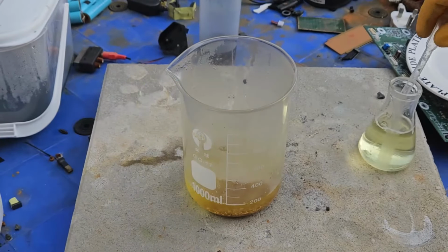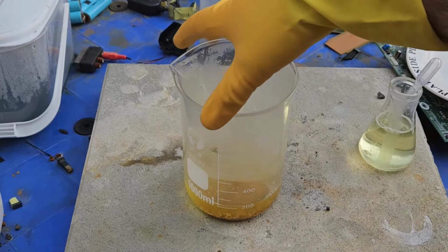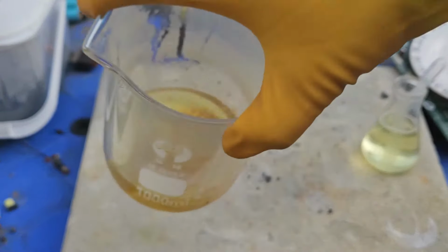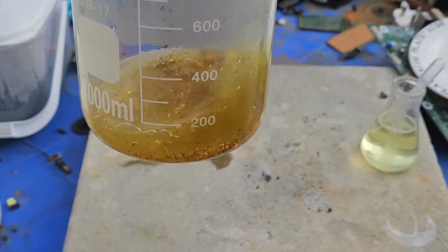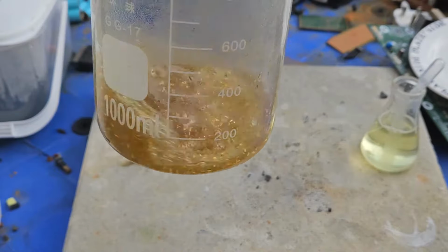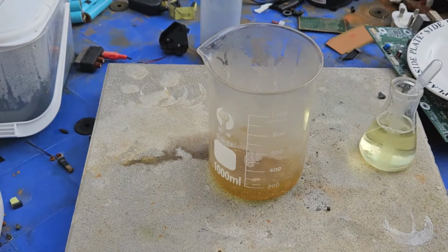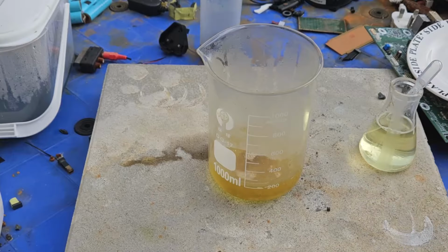I'm going to keep doing that until we start to get less gold. You can see there's a colour in the solution. I hope you can see that, but there is colour going into solution. So we'll leave that, and I'll keep doing that every hour, and keep adding a bit more until I see there's no more gold flakes left, and then we'll come back once we get to that stage.